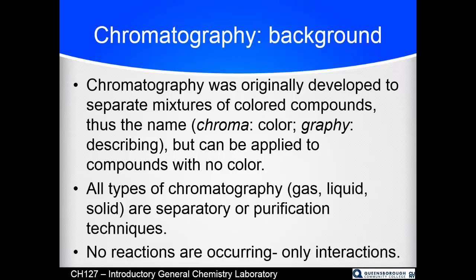So you can do it in a variety of different phases. You can have gas chromatography, you can have liquid chromatography, you can even have gas liquid or liquid solid chromatography. In all cases, only interactions are occurring, not reactions. So you're not reacting your compounds together, just like they're not reacting in the mixture. So you are separating your mixture via physical means, as is typical, and your mixture was combined physically. So it kind of makes sense.